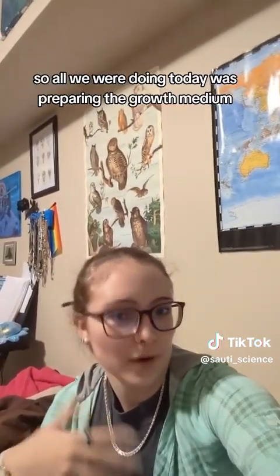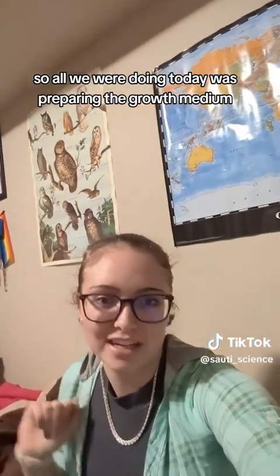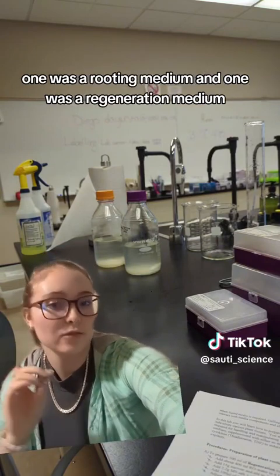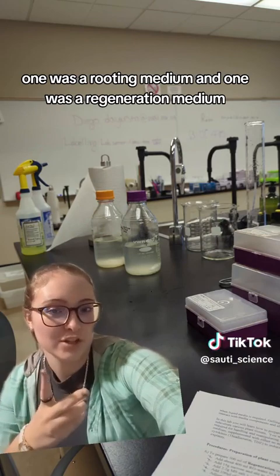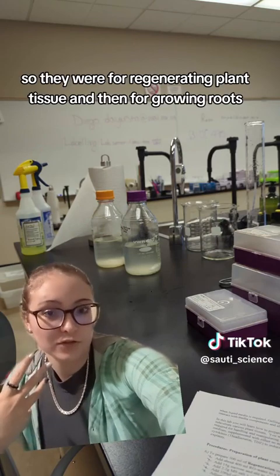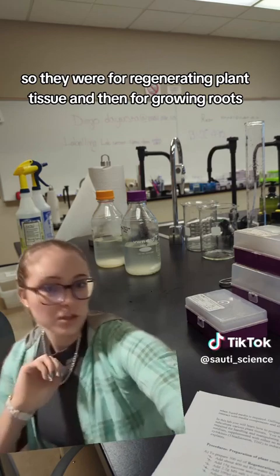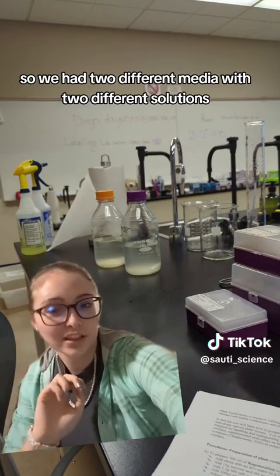This was the first half of the lab, so all we were doing today was preparing the growth medium. We had two different media that we were supposed to make: one was a rooting medium, and one was a regeneration medium — for regenerating plant tissue and then for growing roots.